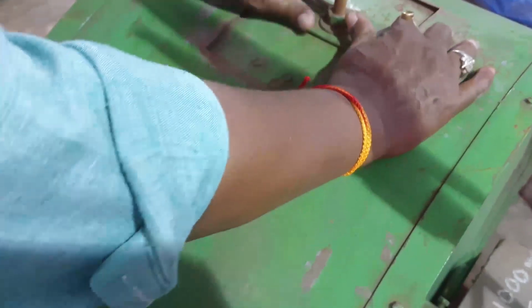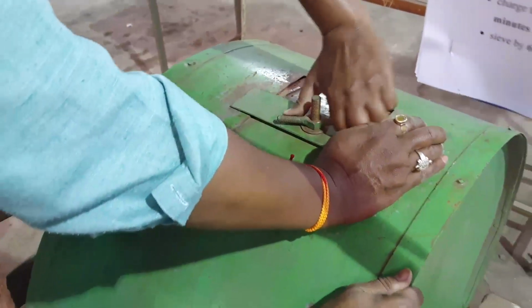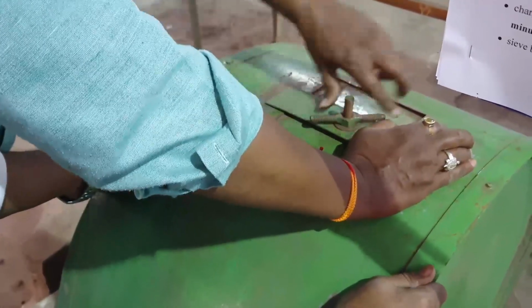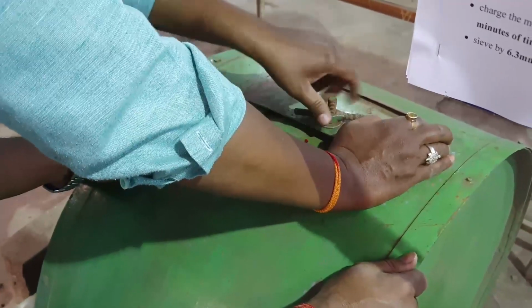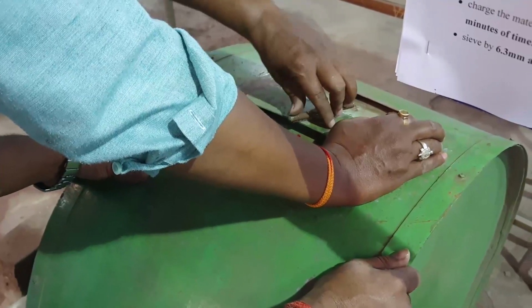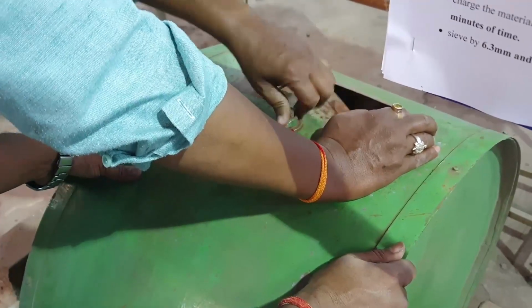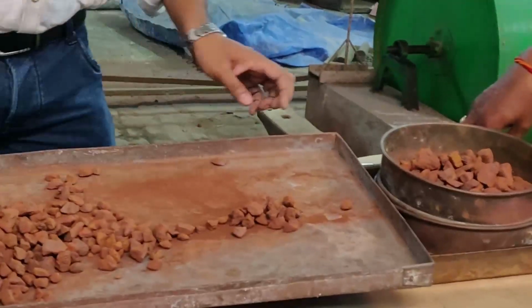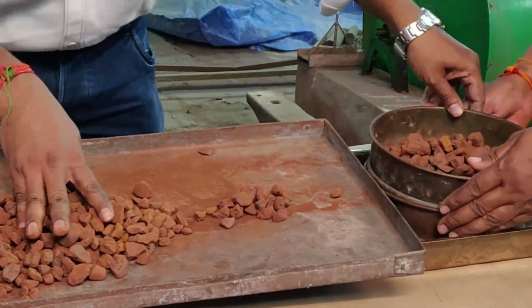Now we are taking the sample out. After the tumbler test, we received the initial material weight fraction. Now we are sieving it with the help of two sieves.